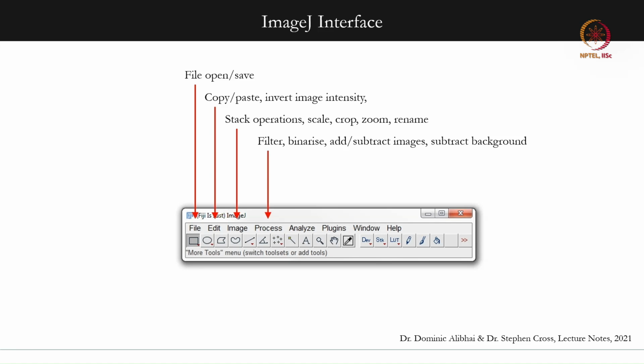And then there are operations like filtering, which is very essential, and we'll also be exploring a few filtering techniques. These are essentially noise reduction techniques. Our experimental data is usually very noisy, and we need to filter out unwanted noise from that for getting useful data. So we'll be exploring a few filtering methods here.